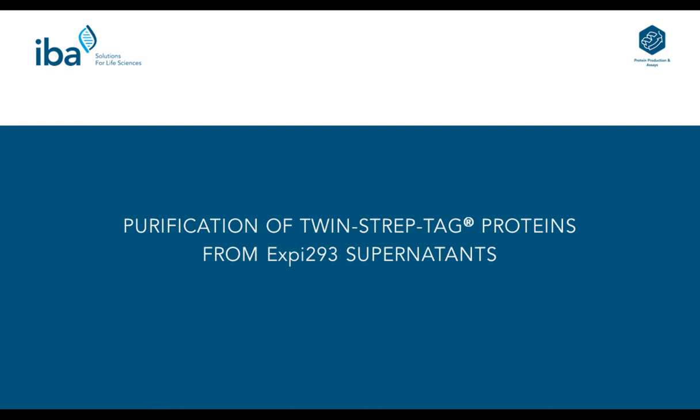So, let's get back to the initial start of the presentation. When we saw the problems you can have purifying His-tag proteins from Expi supernatant, the question was if there is an attractive alternative. And when I was at a conference, I talked to Henry Chu, the product manager for the Expi system, and we discussed the topic about the problems with His-tag purification, and he was wondering if our Strep-tag system might face the same problems, or if it would be beneficial for the purification of proteins from Expi supernatants.